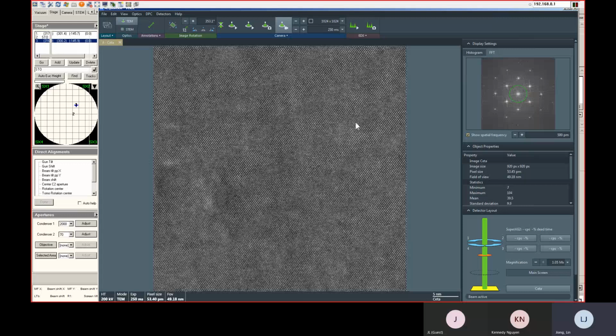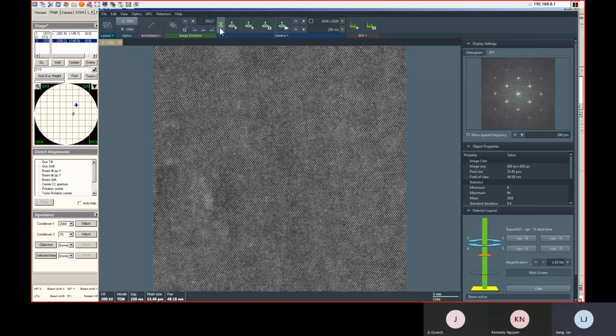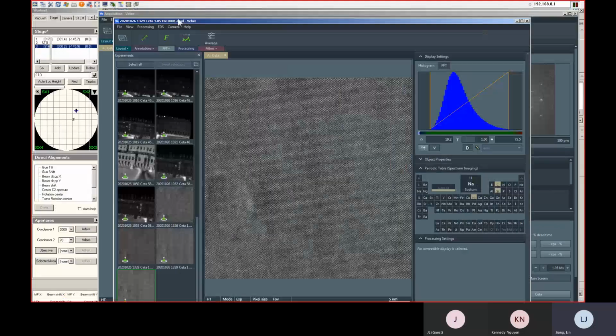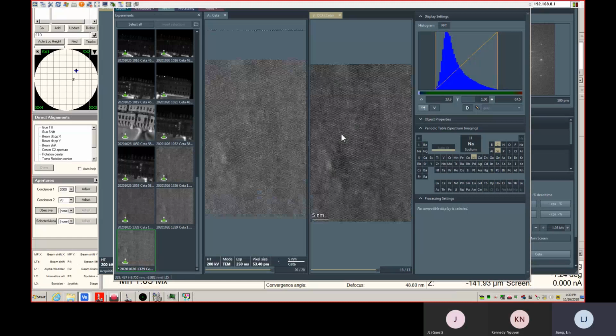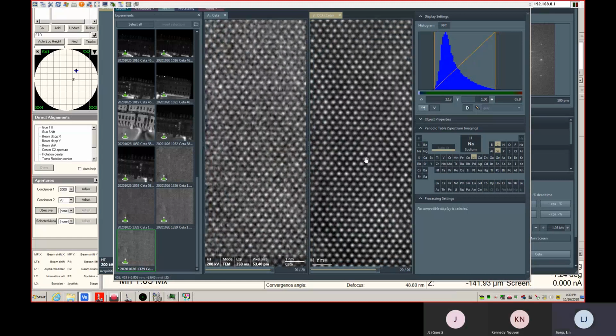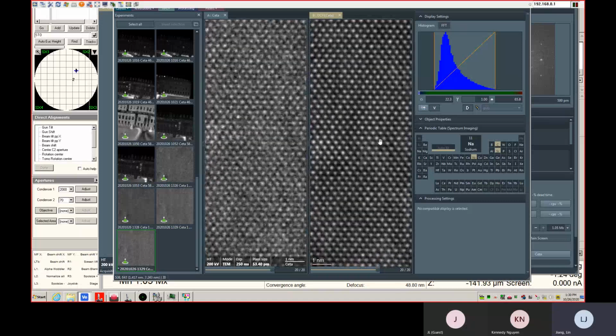You see your acquisition is much faster. In this way, you can remove more drifting. You can go for processing, and process DCFI. Second option, you can see how your image signal to noise is improved by DCFI.